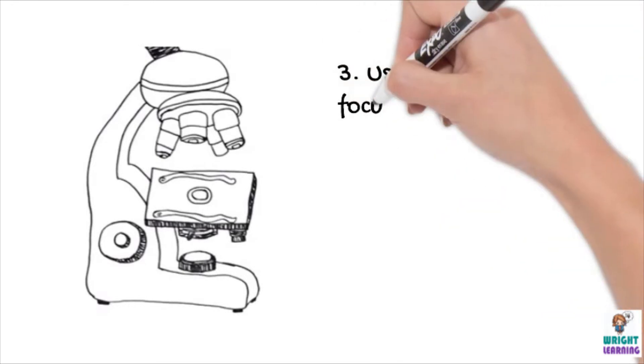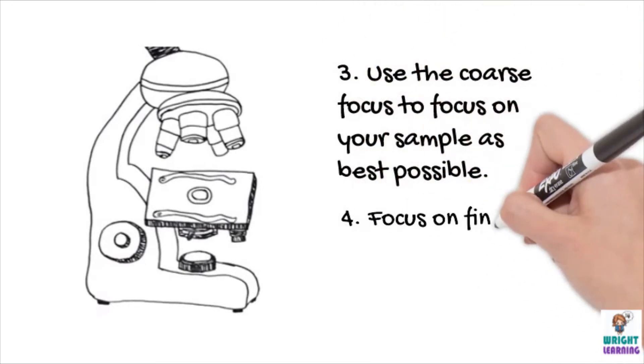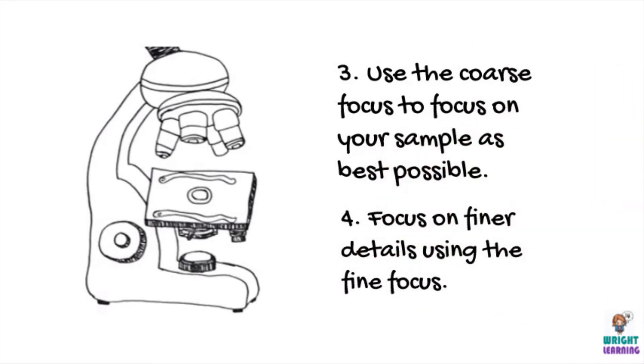Look into the eyepiece, and use the coarse focus dial to focus on your sample. Then use the fine focus dial to focus in on finer details.